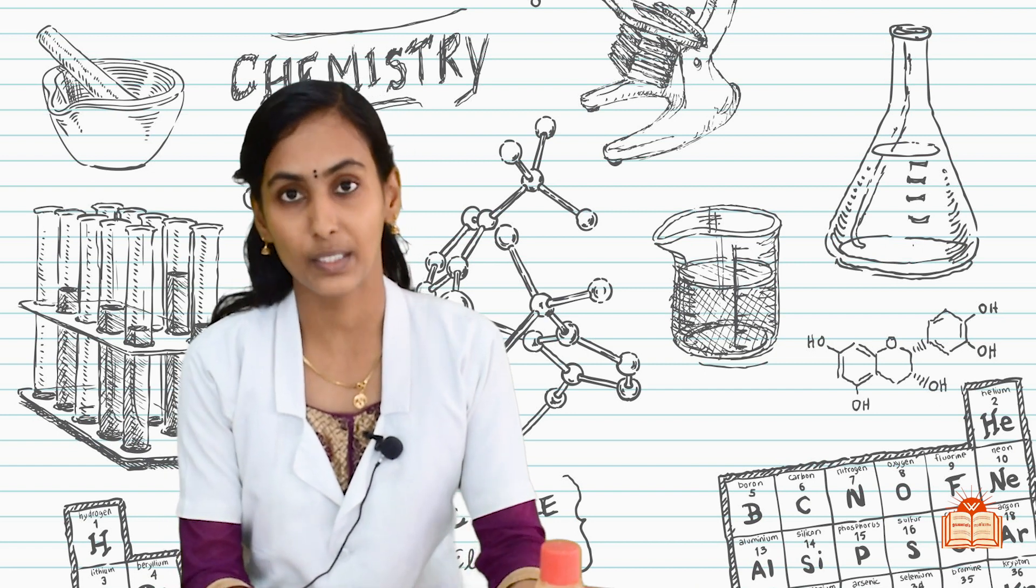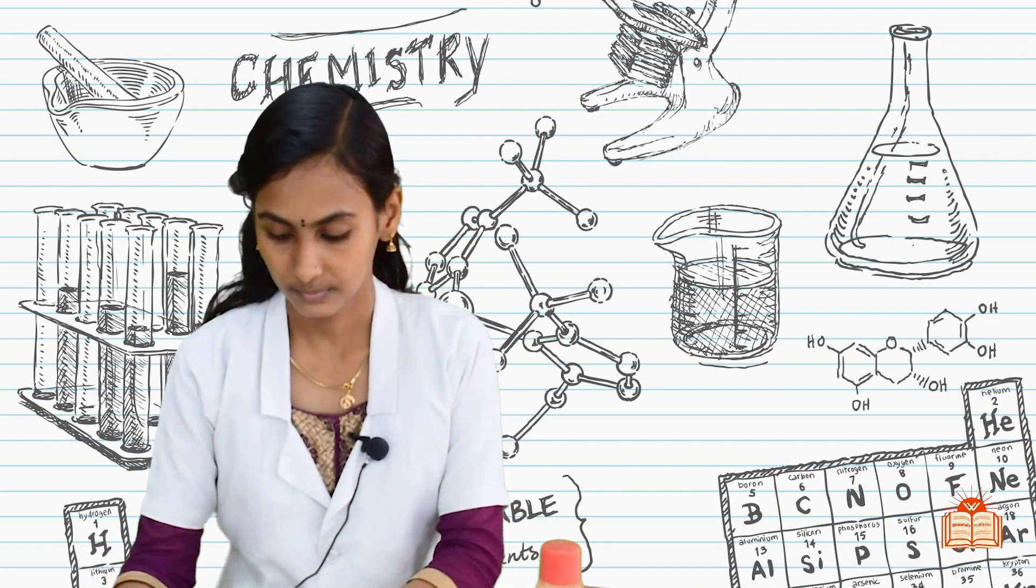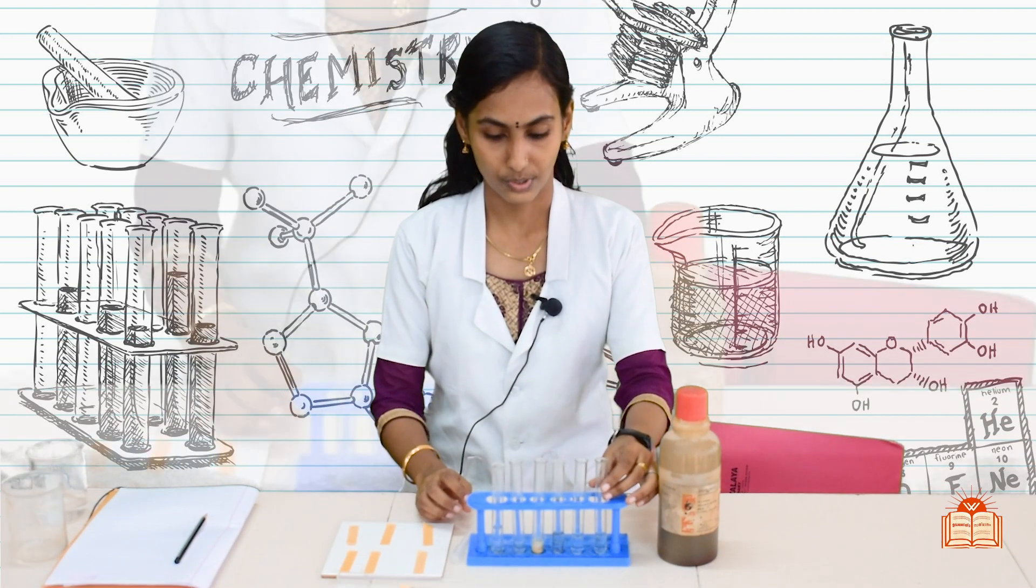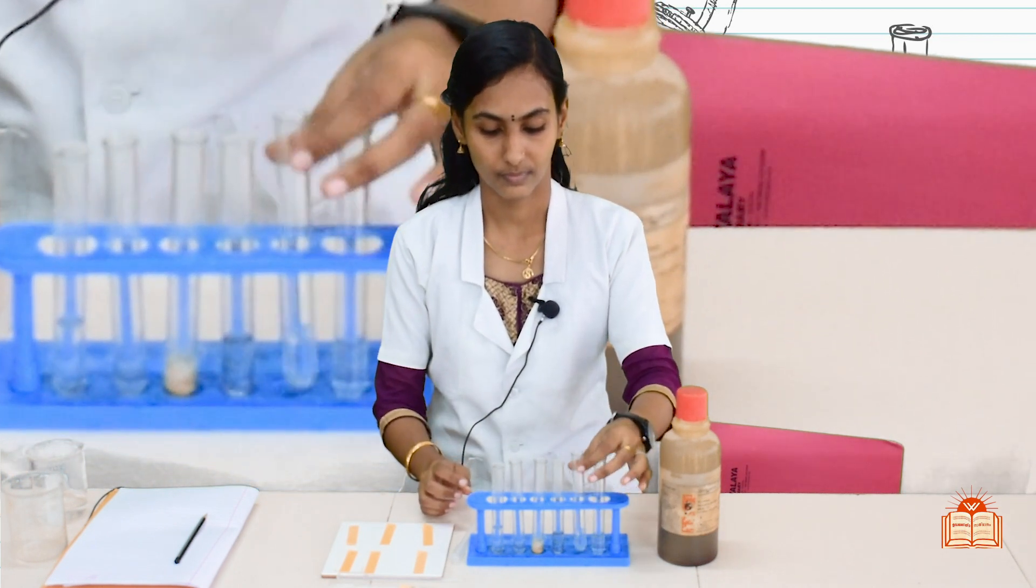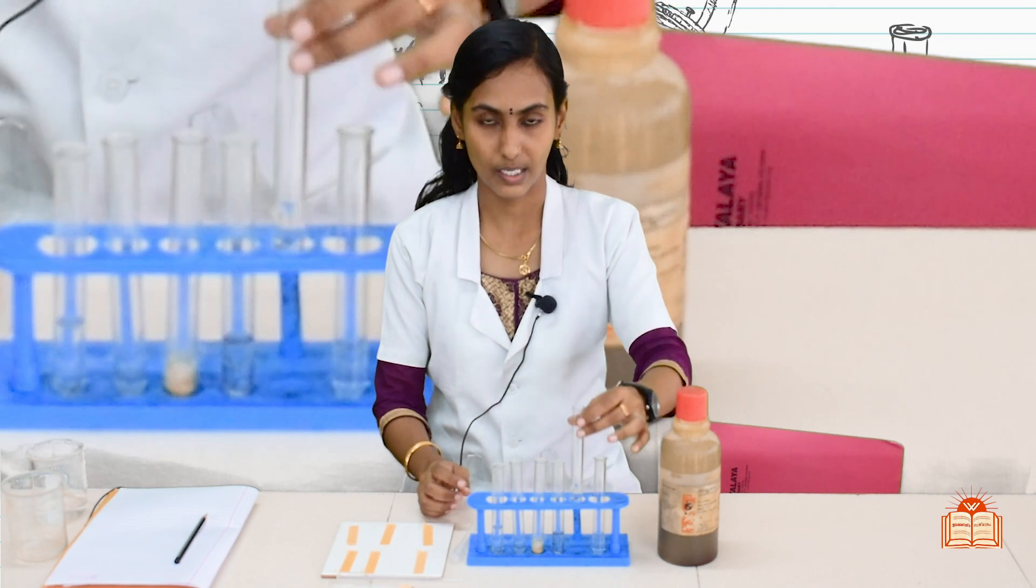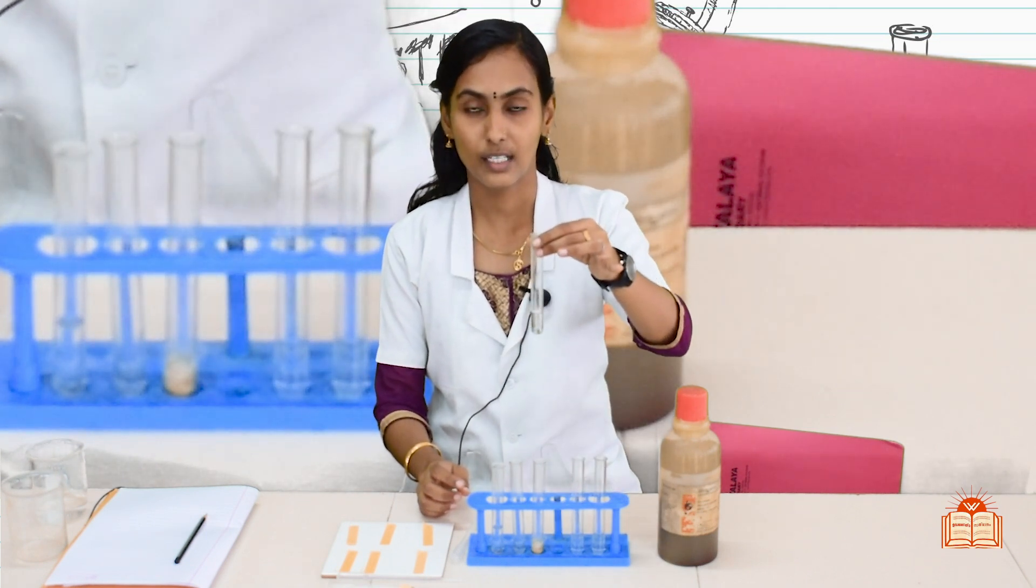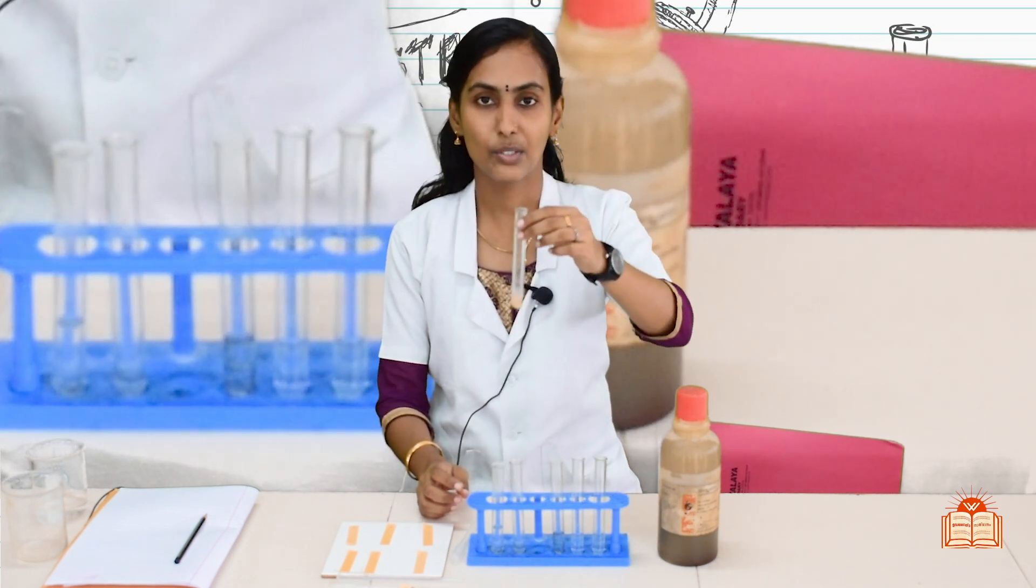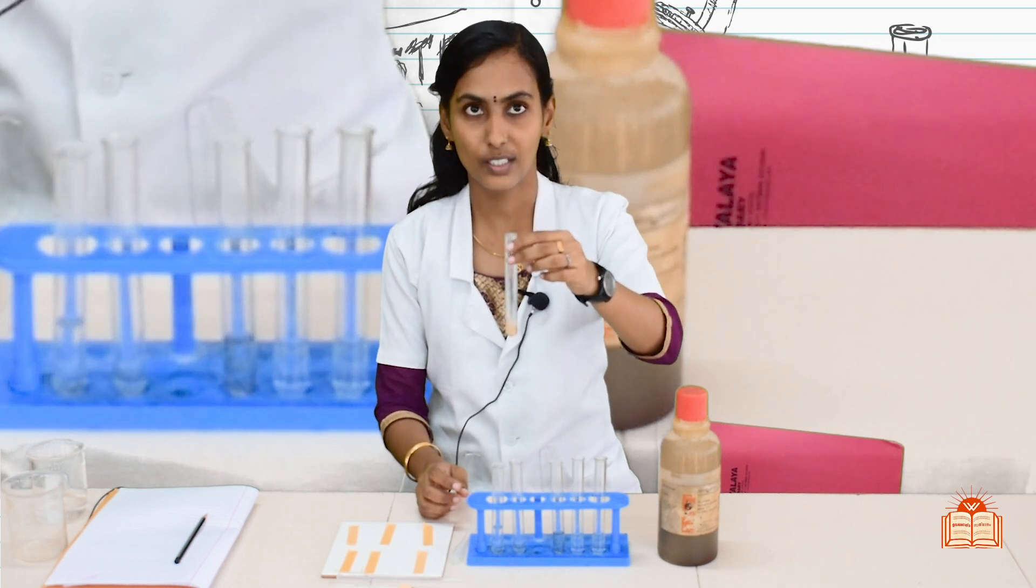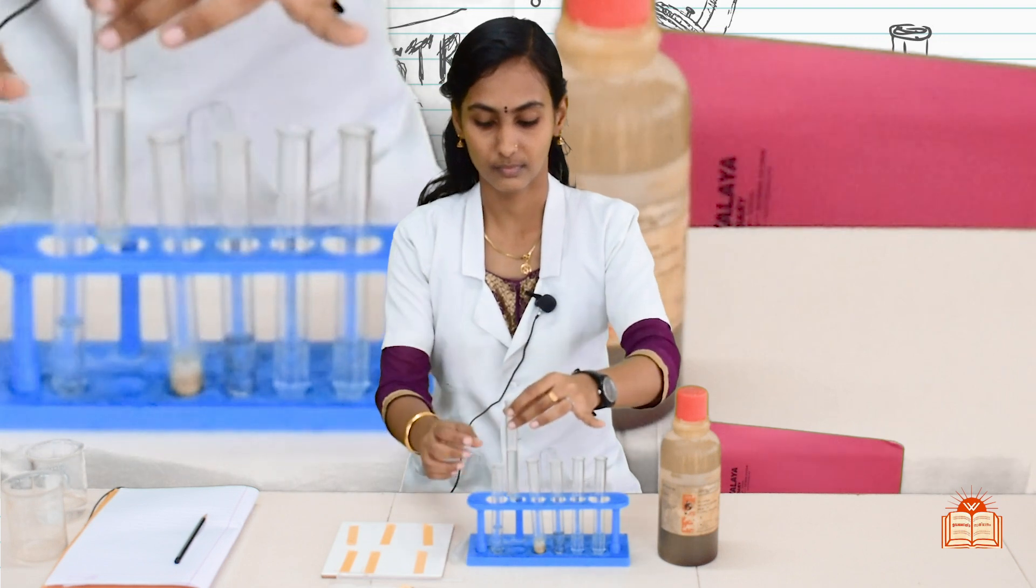Now we will check the pH of various solution. Here I have taken six solutions: dilute HCl solution, dilute NaOH solution, sodium hydroxide solution, ethanoic acid or acetic acid, instead of lemon juice I have taken orange juice, water and sodium bicarbonate solution.